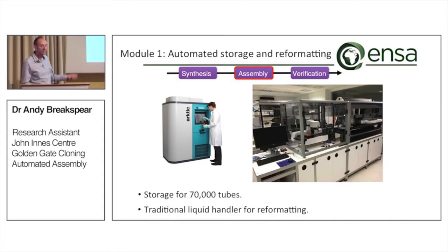Before we had this running, I was preparing the Echo source plates manually. It takes a lot of concentration. If you're doing that, get your noise-cancelling headphones. If you're lucky enough to have a robot to prepare it for you, then it really is super.